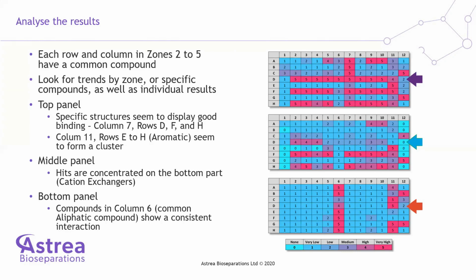And you can see also that the amine, the compound that we put in that is common in column 6, is also present as a bis material. So the two sides are the same, and that will be in well D11 as well, and you see that one is a positive too. So that puts a lot of weight on that specific compound and its combinations. Next one, Eddie.